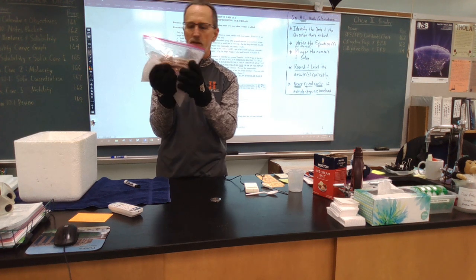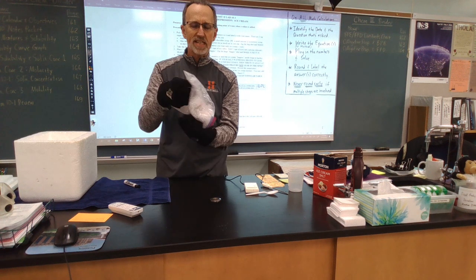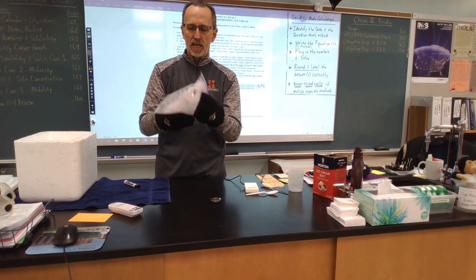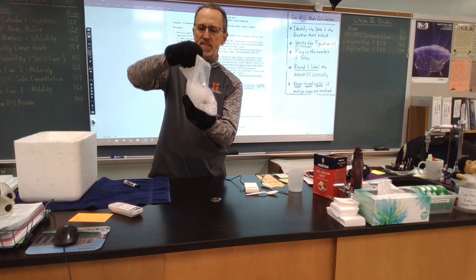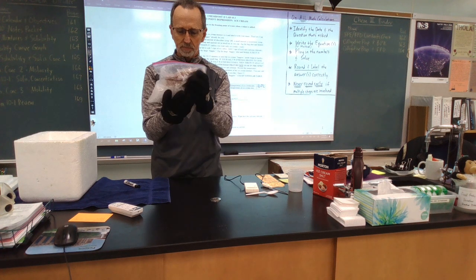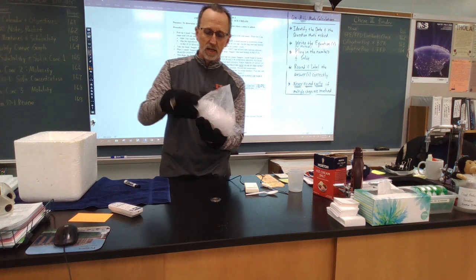Remember, pure ice is right at 0 degrees Celsius, but this ice and rock salt mixture is at a temperature much lower than 0 Celsius, and yet it's beginning to melt, which is exactly what happens on the roads, and that's what we want to happen.